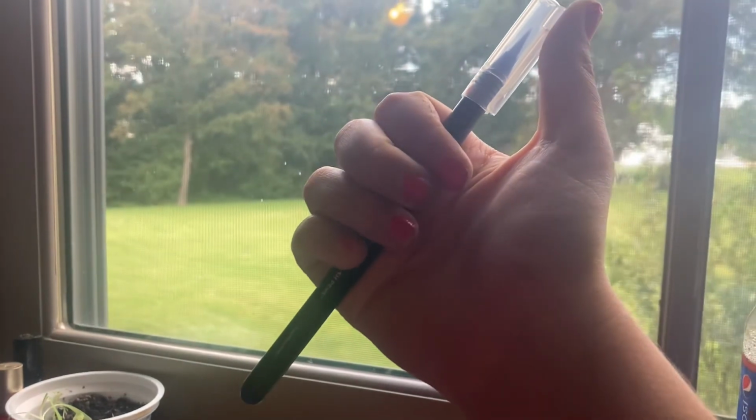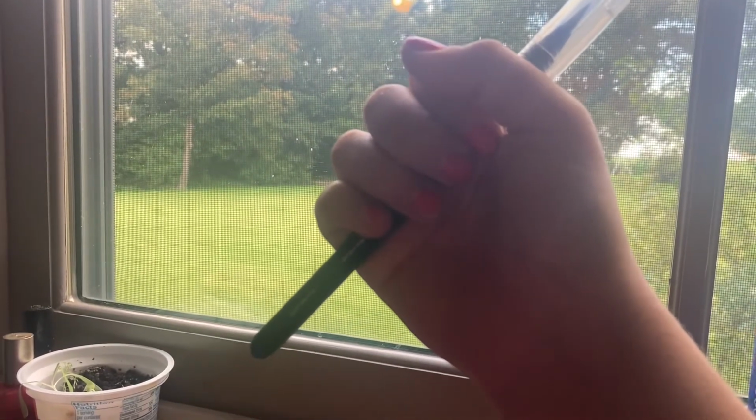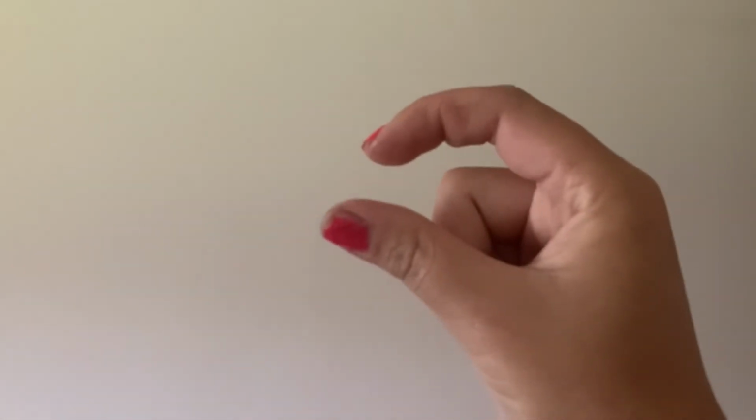Once you've drawn up your sample, you can release the first stop, and the liquid will stay inside of the pipette. Make sure you close your sample immediately after drawing up any liquid.